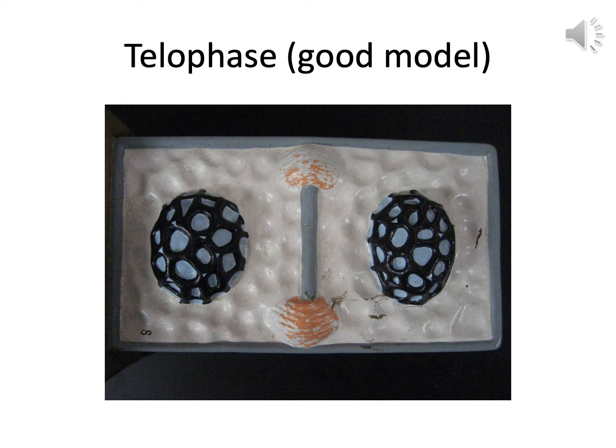During telophase, the daughter chromosomes reach the opposite poles. The chromosomes are starting to uncoil and go back to chromatin. The nuclear membrane has not formed on this picture. Imagine a red line around the 2 nuclei soon. The nucleoli have not become visible just yet. The other thing that's happening is that silver line down the middle. That's the cell plate that forms from the inside and spreads towards the edges.